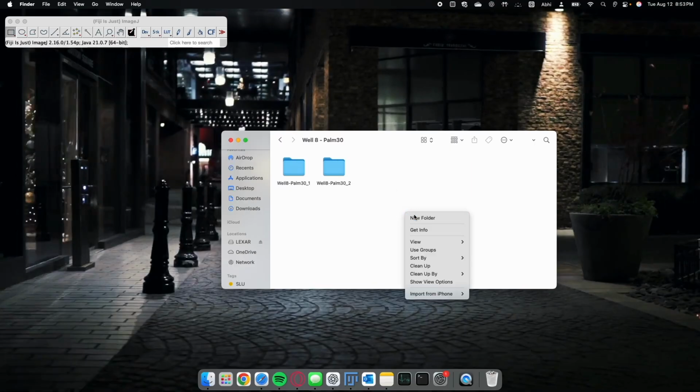For the sake of demonstration, let's quickly showcase. Let's do a test file, how to image and acquire images that you can use for a slideshow maybe, and for further analysis from a microscope file. So of course let's call this test file, but let's also add just well 8 30 just in case. So now we have a storage location for our files.